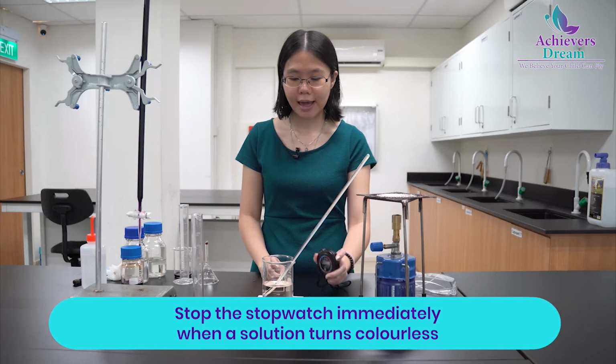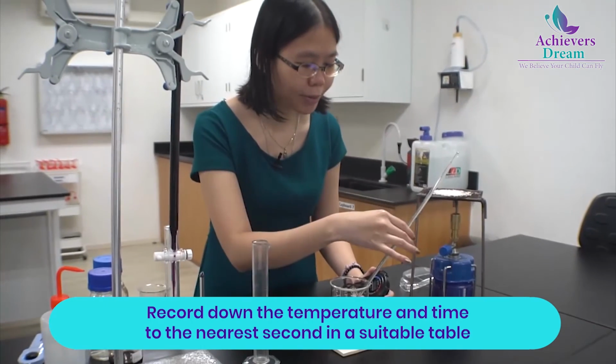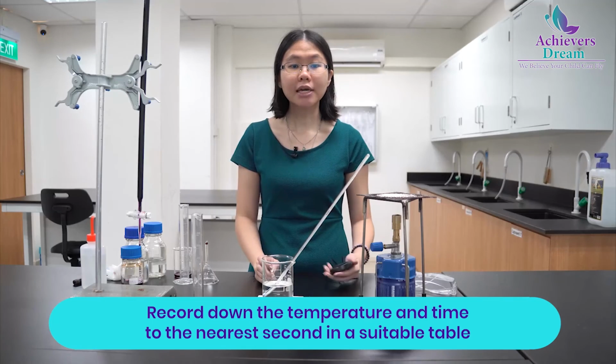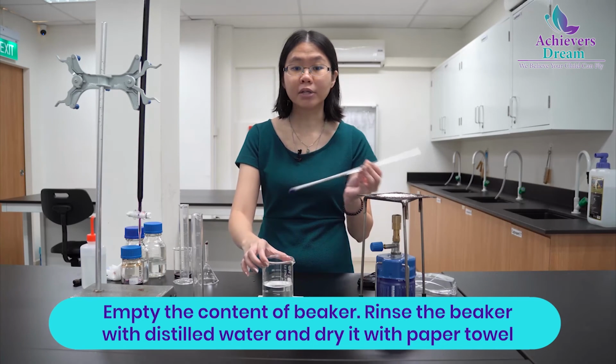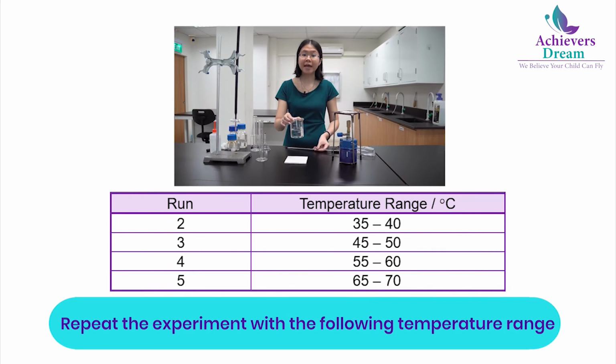Okay, and stop. So I will record the temperature at this point and the time at this point. After that, I will empty and rinse this beaker and dry it for further use. You need to repeat the same experiment 4 times at the same volume of solution but using different temperatures.